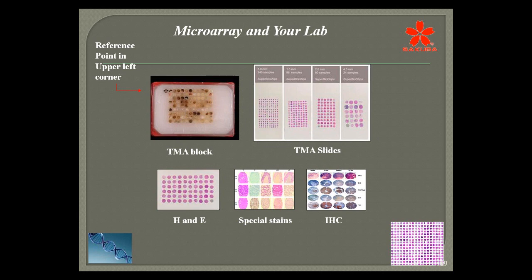I would never use infectious material in an array, and I'll tell you why. Our microorganism controls are very precious. We don't come across them very often. So if you have a very unique fungus or bacteria that you're using, whether it be for special stains or immunohistochemistry, you'd hate to put it in an array block, at least in my opinion, and cut it away every time, even though you may be using it for infectious stains. You don't need to exhaust it. So I still use a single, or no more than two, infectious or microorganism disease tissues for control slides.